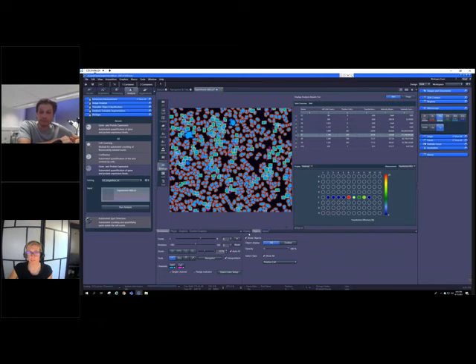Great. Go ahead. Yeah, sorry, Sam. Just to mention, as mentioned, they're all based on our standard image analysis wizard. So you can directly go from your bio app analysis back into the analysis wizard. For those of you who would like to add another layer of objects or classes, you can directly use the bio app information and get started with a new experiment image analysis setup.